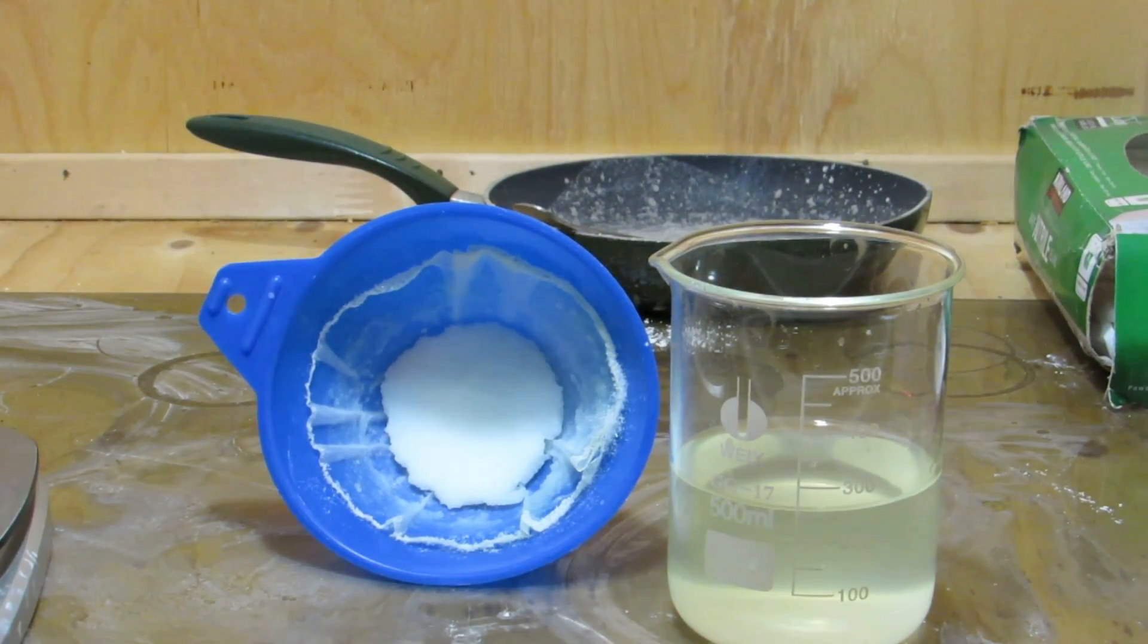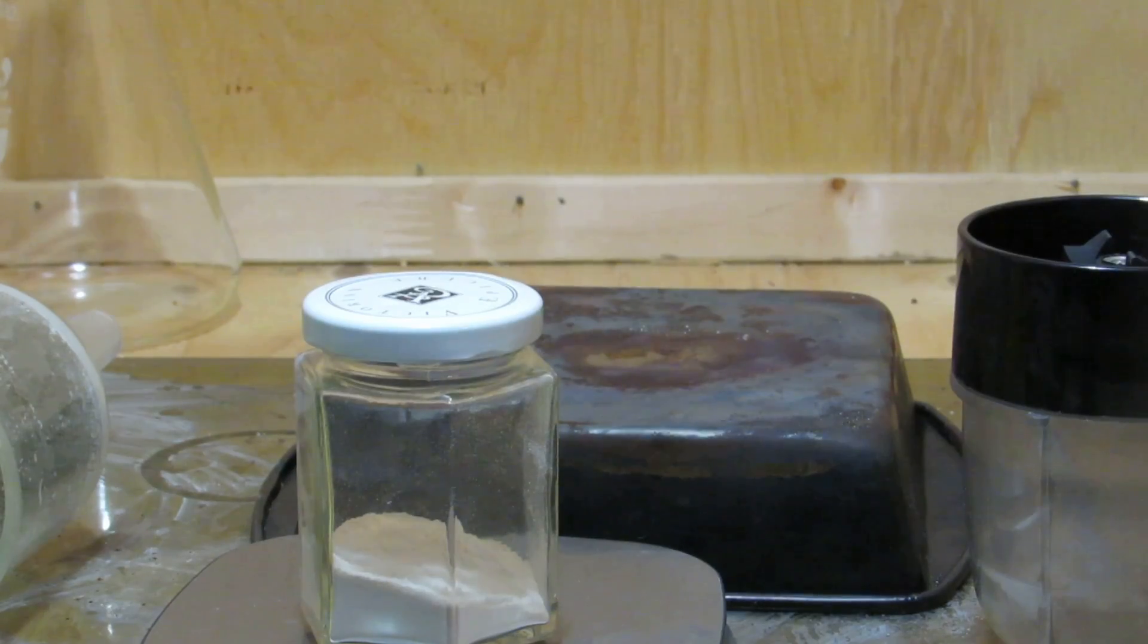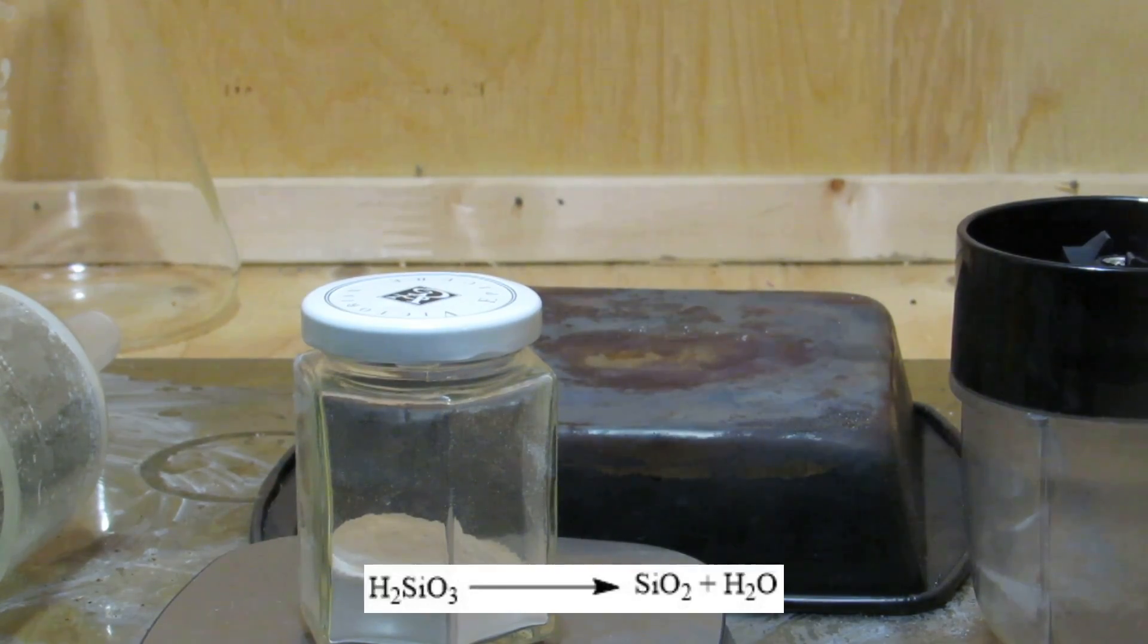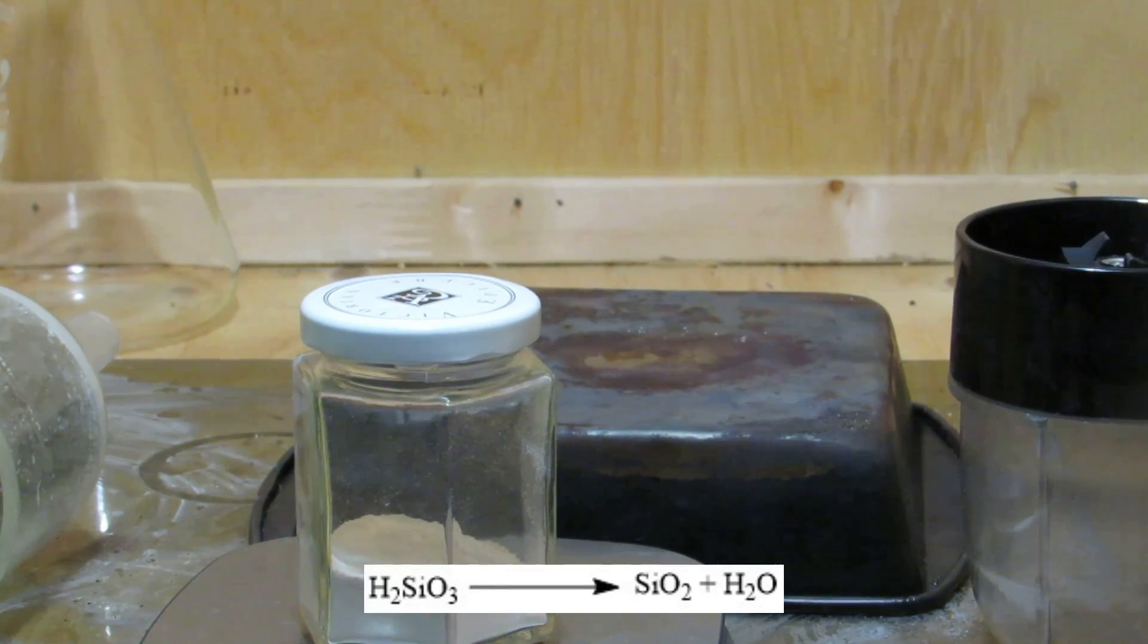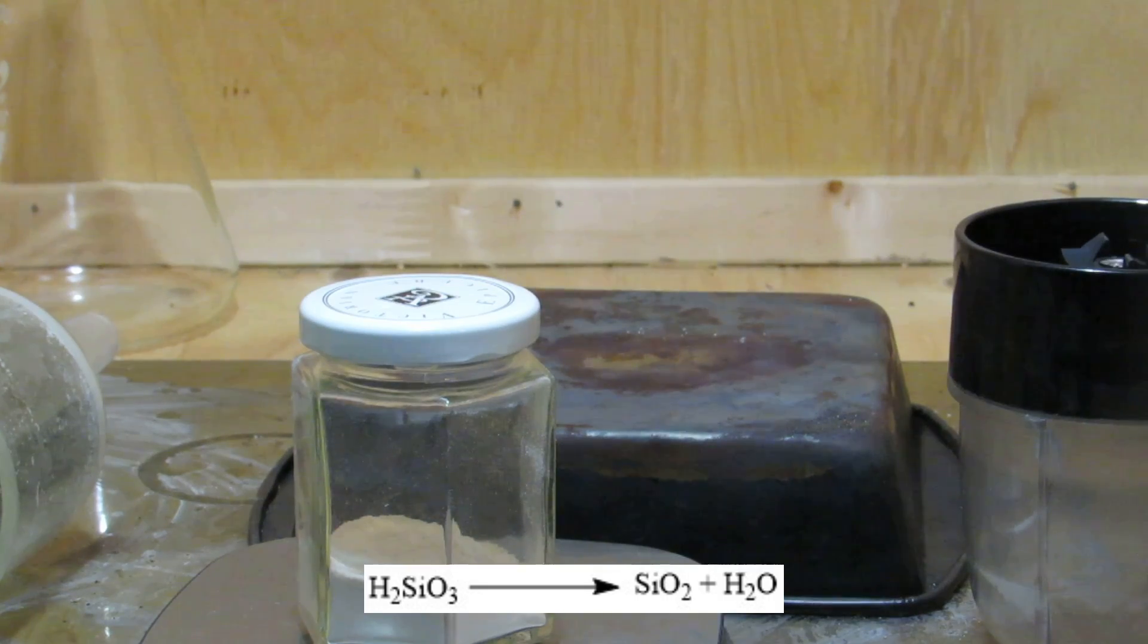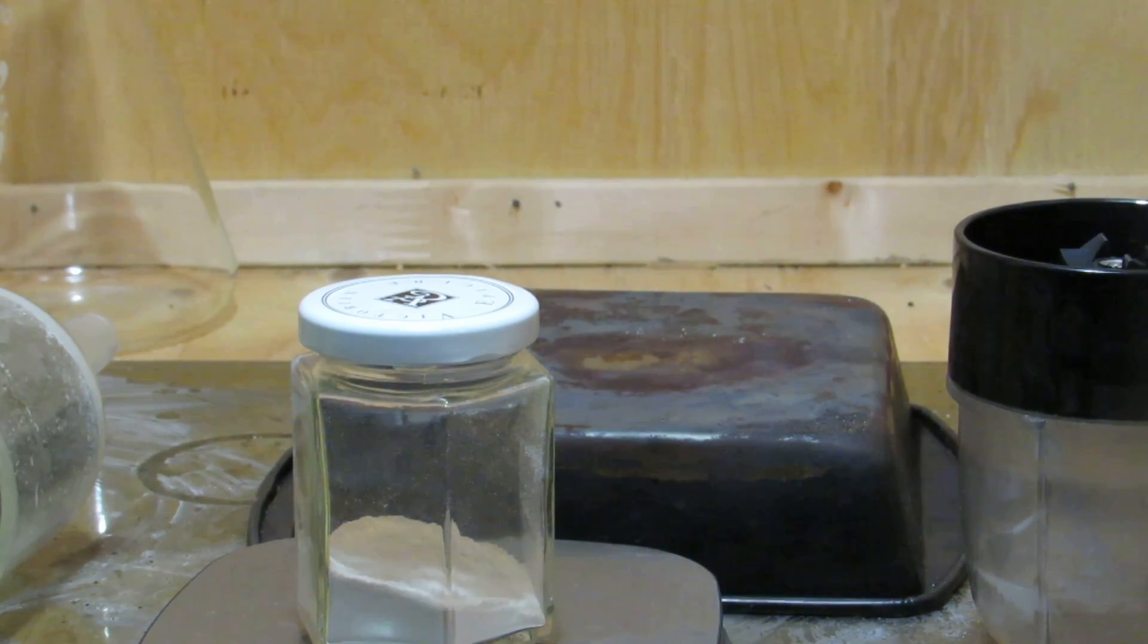After filtering, the silicic acid was heated in an oven to 400 degrees Fahrenheit to drive off all the water and decompose it to amorphous silicon dioxide gel. In total, 13 grams of pure silicon dioxide gel was obtained.